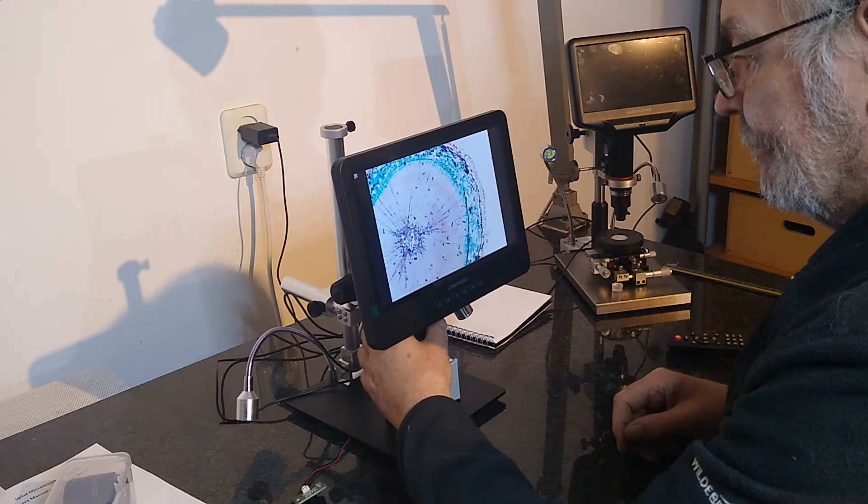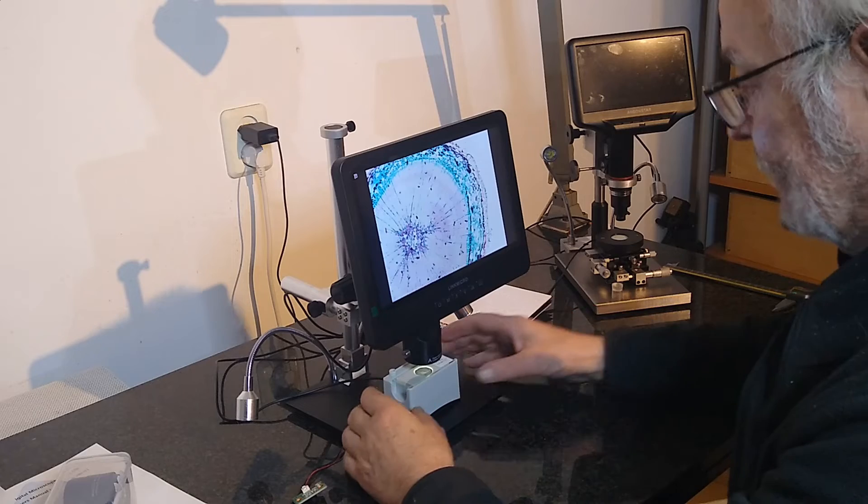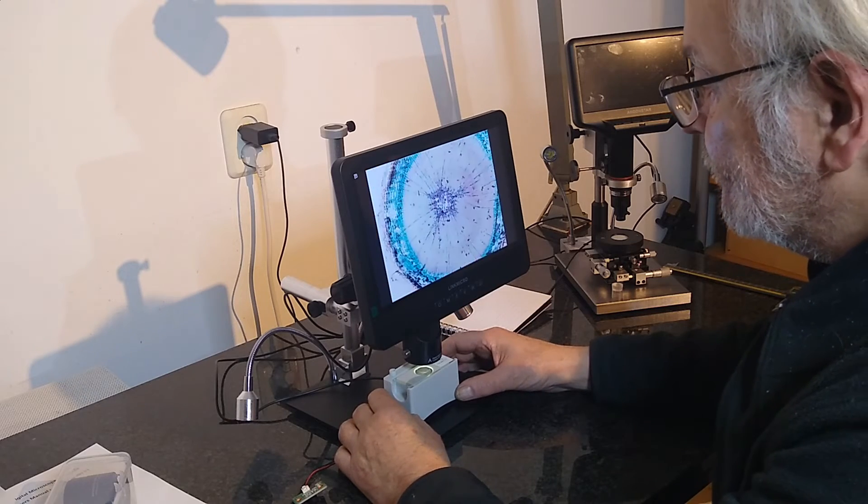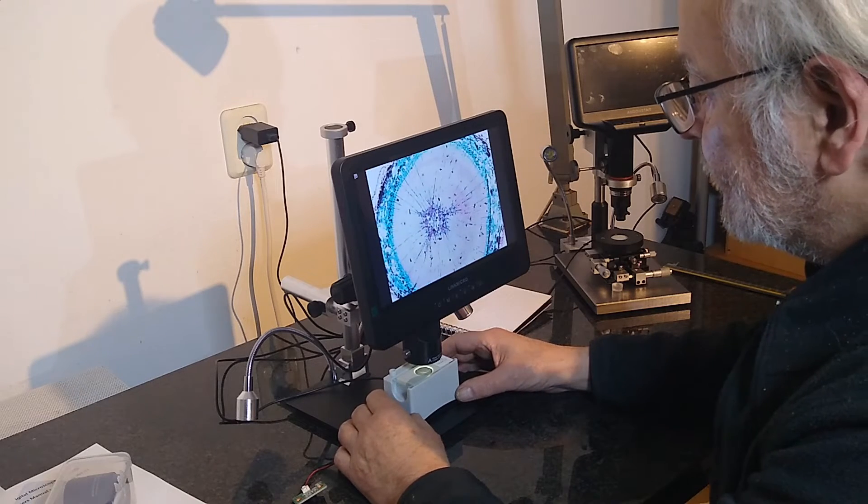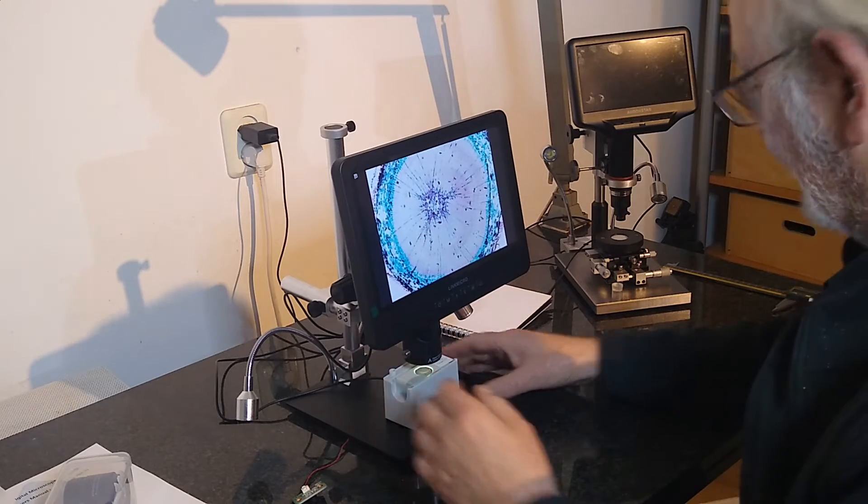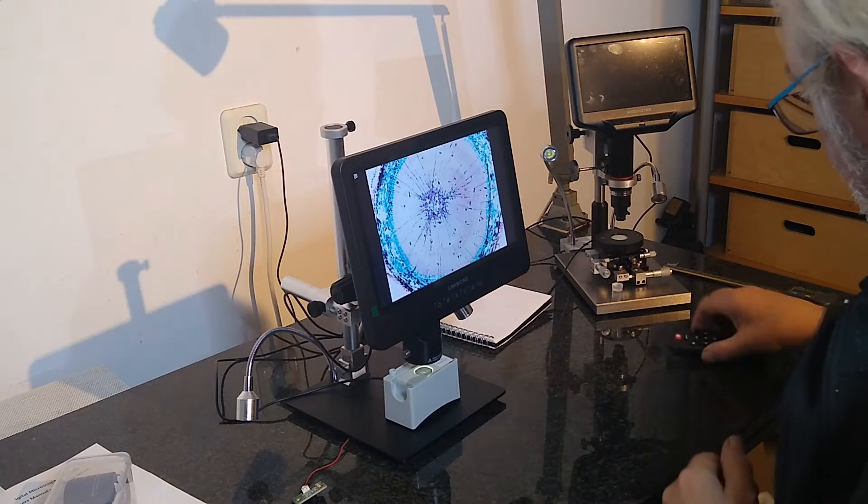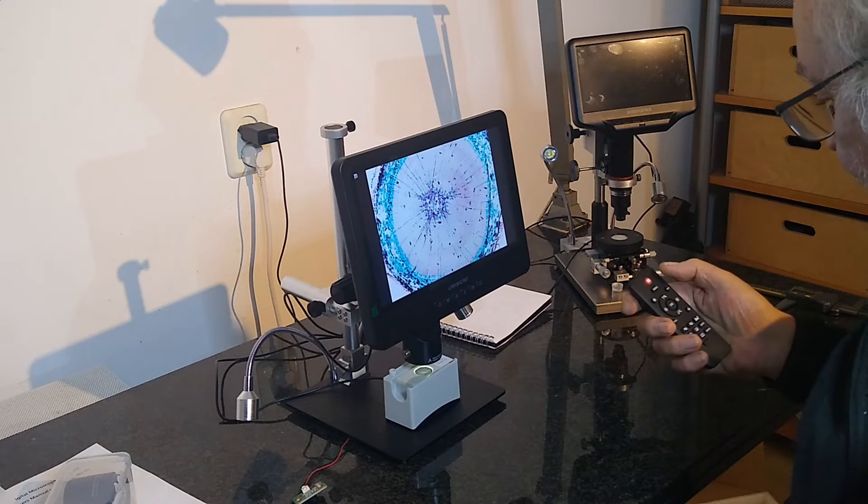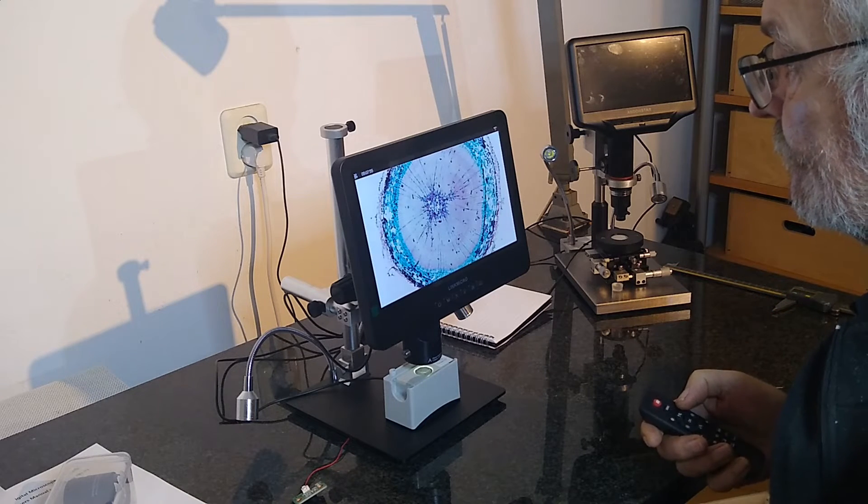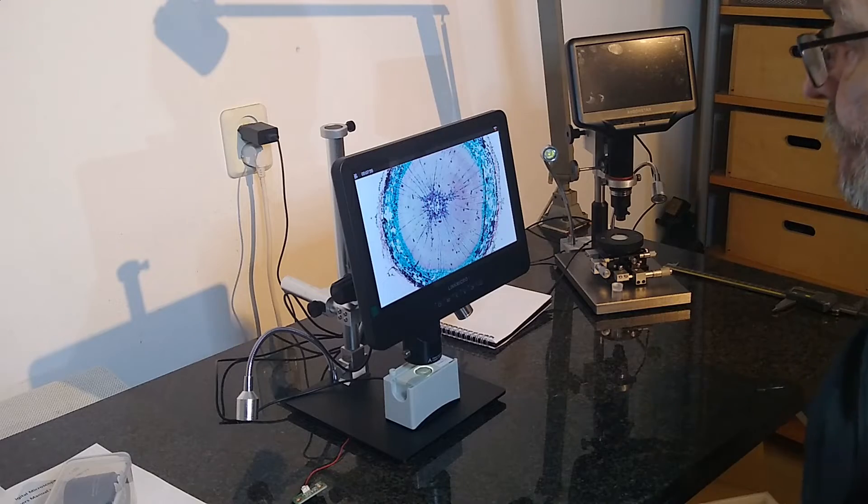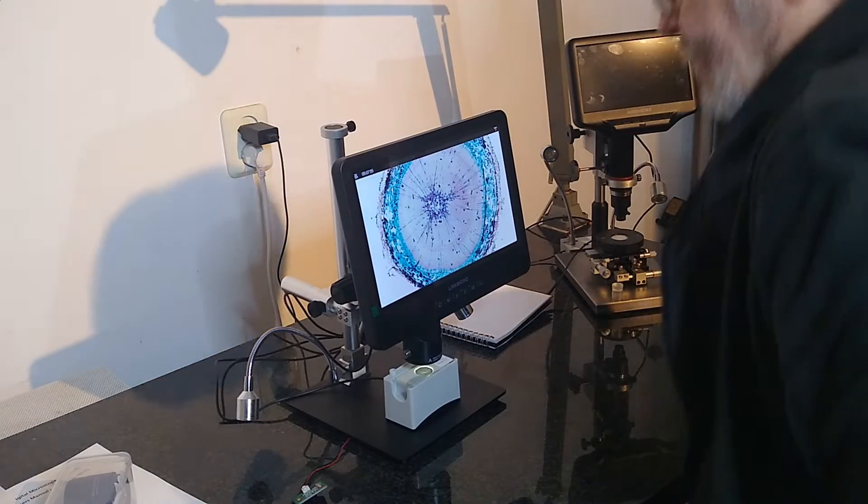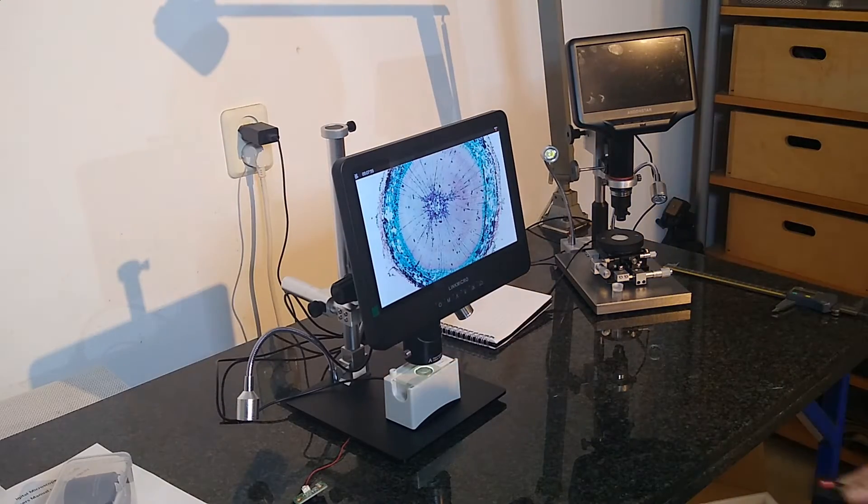There is a problem here. As far as I could determine, the image sensor in the camera is only 4 megapixels. So every shot with a higher resolution than these 4 megapixels is interpolated, and the image is artificially boosted.